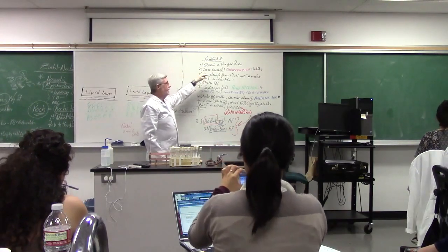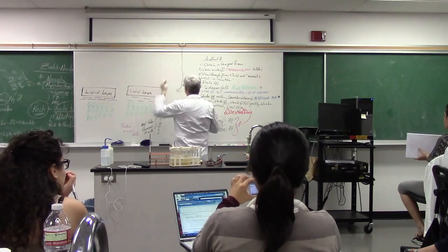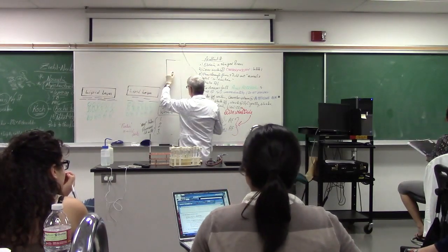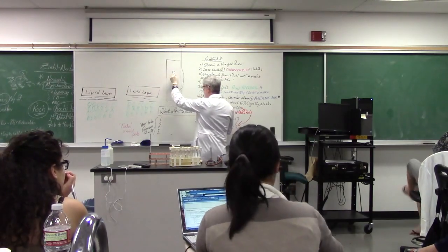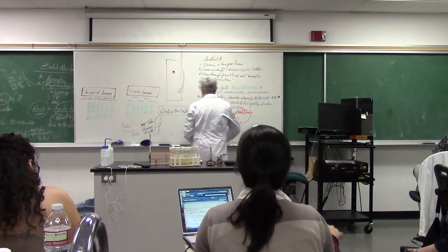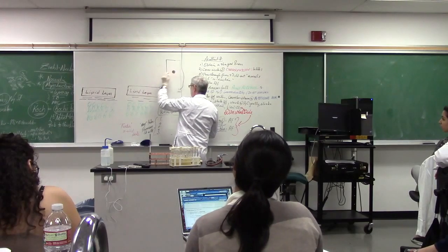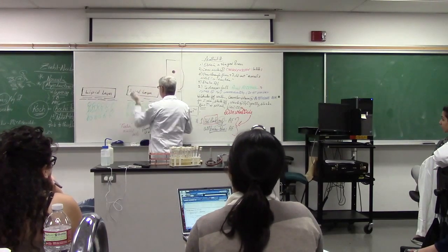All right, and then you're going to take that circle, and by the way, this is one where you're going to have your slide like this, and you're going to put your little circle a little bit past halfway, and you're going to make your smear here, and then you're going to cover this with carbol fuchsin. You want your slide to look like this when you make it.